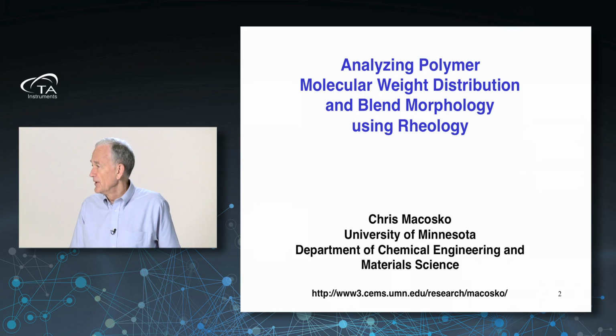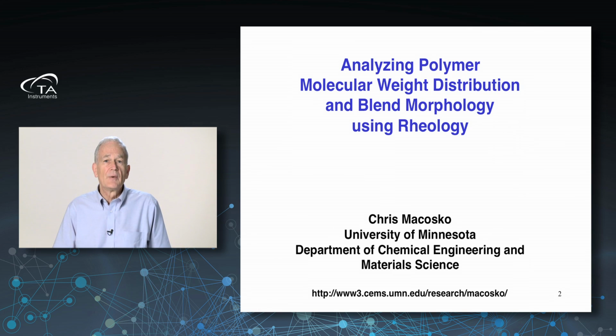Thank you, Adil. I'm excited to be here and to tell you about how we can use rheology to look at molecular weight distribution and polymer blends.